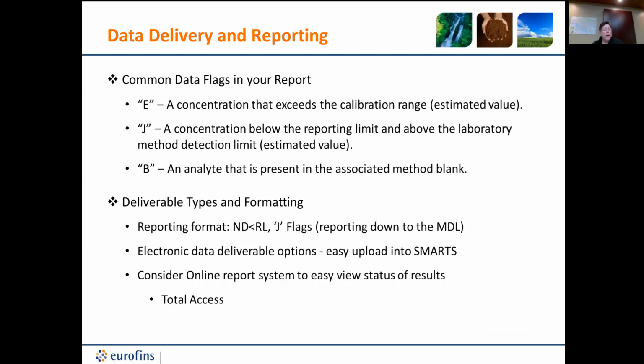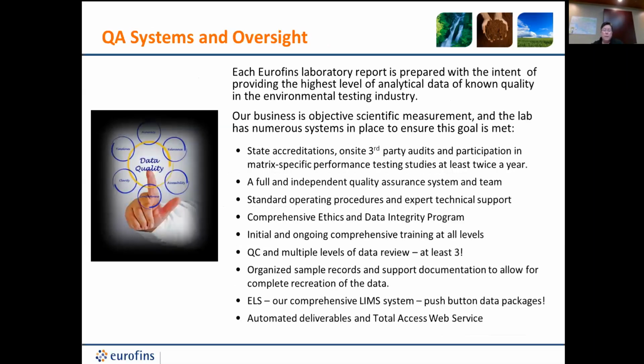We have TotalAccess online. We can have it sent to you. You can pull it off online whenever you want, or it can be emailed directly to you. You can also see the status of things if you're in TotalAccess and have that set up. And that's another thing that your project manager can help you get set up on. It's an easy way to access your data.